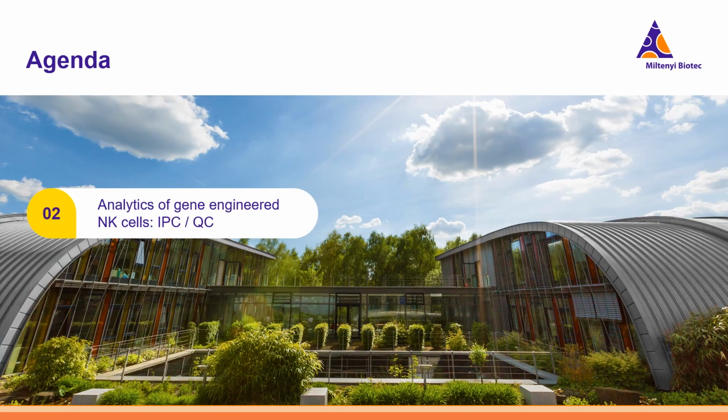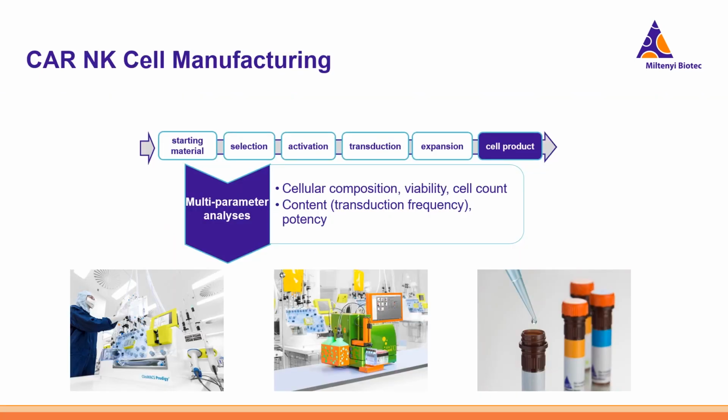I will now talk about our analytic solution for the CAR NK cells. As many of you are probably aware, setting up the analytics for a cell manufacturing process is actually as much effort as setting up the manufacturing itself. So it's important to really not underestimate this part.